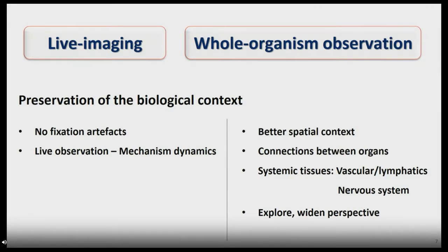When you want to address complex scientific questions, you want to have the perfect and most optimal biological context. For live imaging, you don't have fixation artifacts. You can observe live what is happening. You can see the cell moving, what it does. And if you go for whole organism observations, you don't need to dissect things, so you don't do any damage.